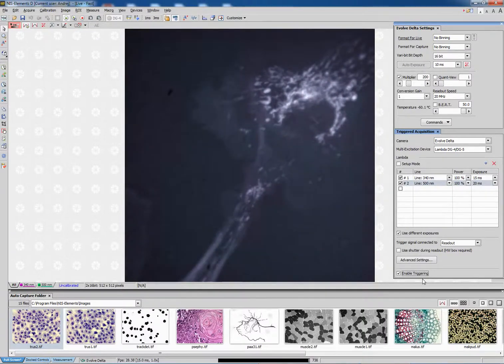So we're doing 57 frames a second, and we're allowed to use another 5 milliseconds of exposure time here between the two different channels. It's a really nice, really strong function, smart streaming, and it is Photometrics exclusive, the way that we're handling and controlling this.